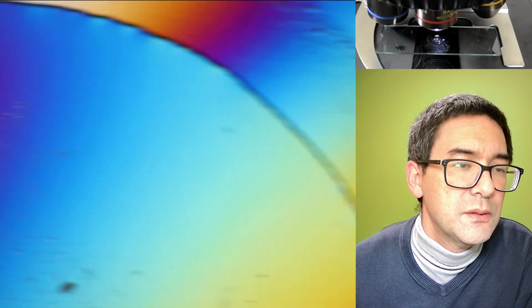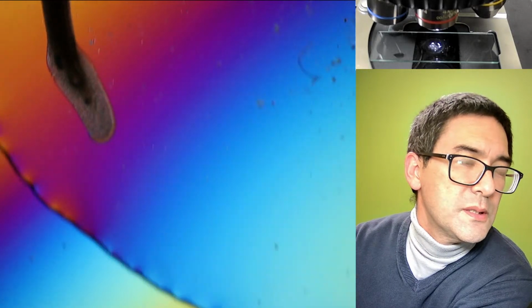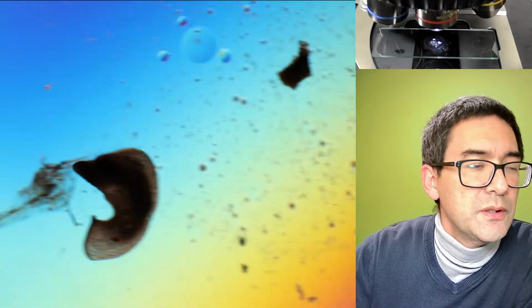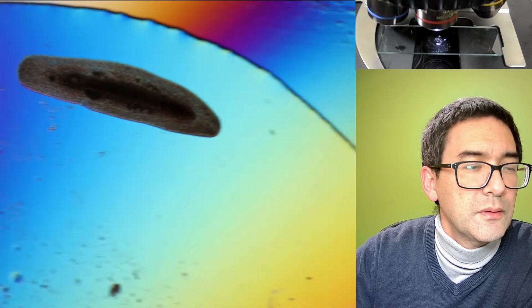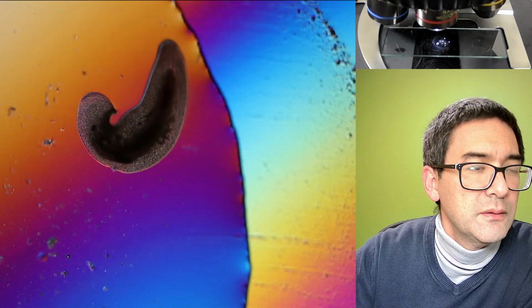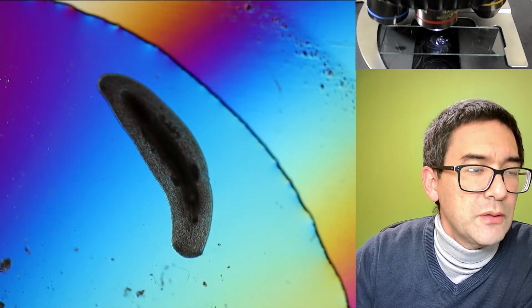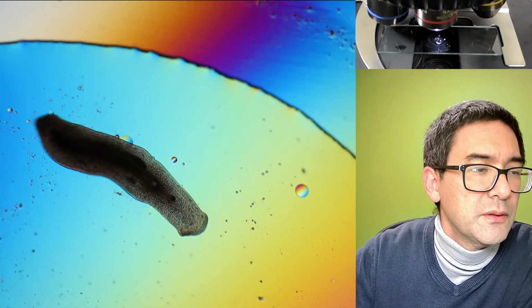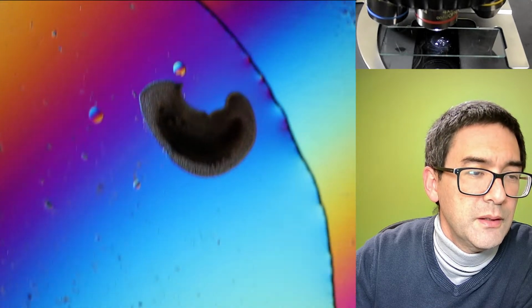And where is it? Here it is. Let's see if it starts to avoid it or whether it actually uses the thing here as a food source. But it seems to stay on the edge here of the water droplet. And it could of course also be that it's not necessarily the spiciness. See those round fat droplets, it could be some other substances in there that it might respond to.